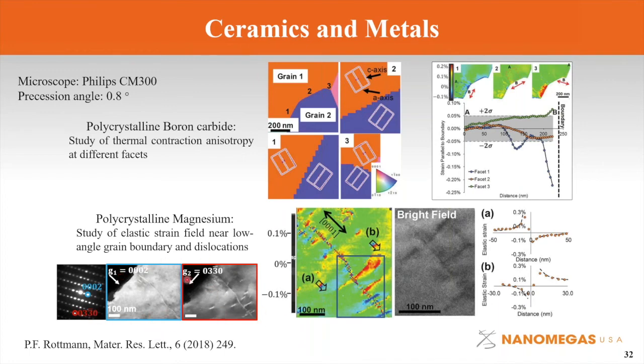This shown at the bottom left is the construction of virtual dark field image. Recall this is one of the tools in the ASTAR orientation map. So because you have a 4D STEM data set, you can use a virtual aperture to build VDF images. So you can work out those planes are actually basal planes based on the g·b visibility rule.